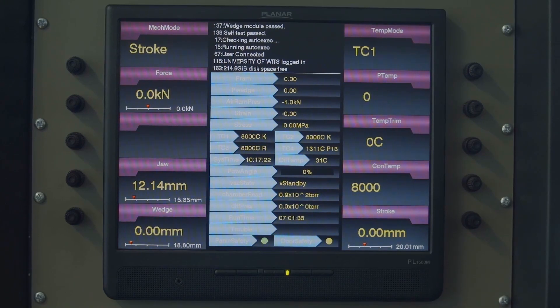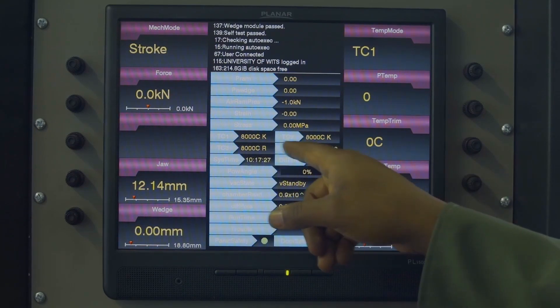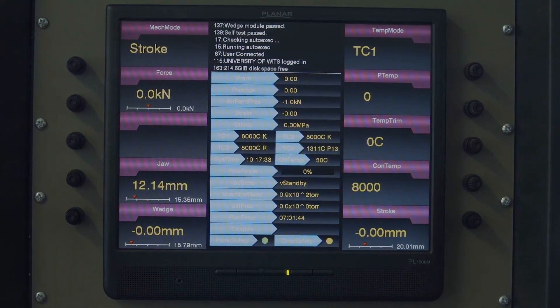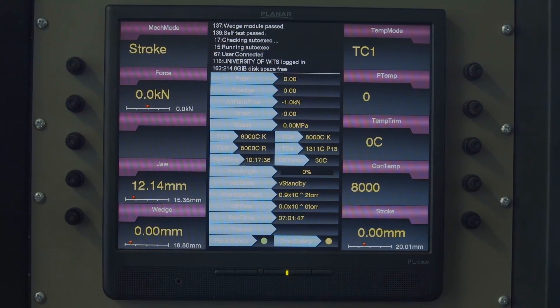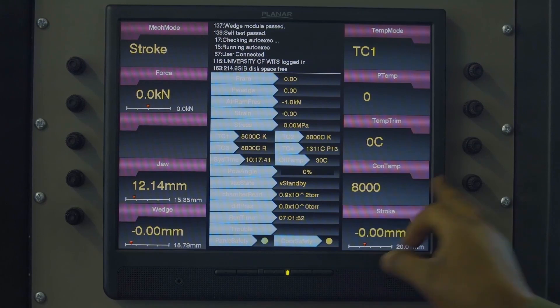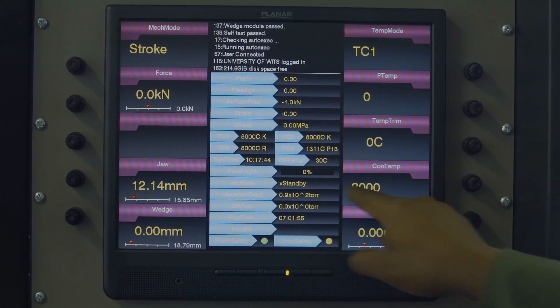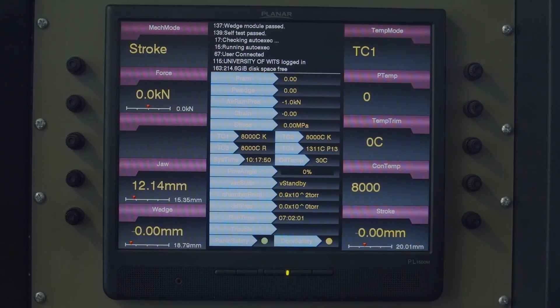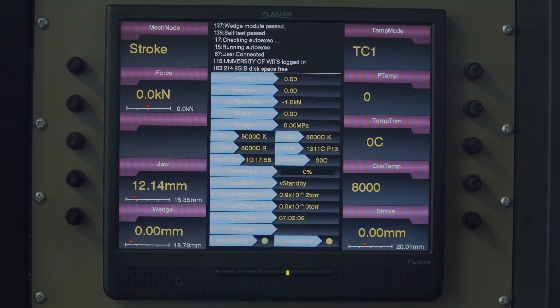Previously on the compression chamber I already showed you that we had four terminals: TC1, TC2, TC3, and TC4. We are using TC1 for this test because we are going to connect our thermocouple to TC1. Before connecting the thermocouple, the temperature would read 8000 as you can see here. We are concerned with the TC1, so it's going to read 8000 Celsius, but we do know that the actual temperature is not 8000. Once we connect the thermocouple you will see the actual temperature of the sample.